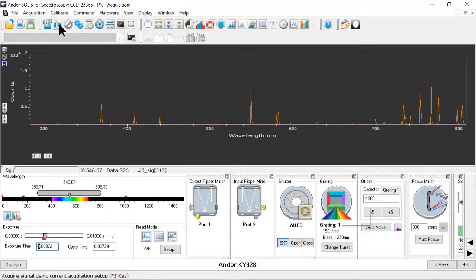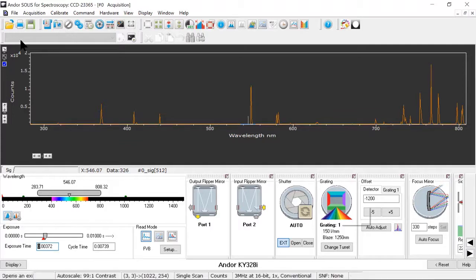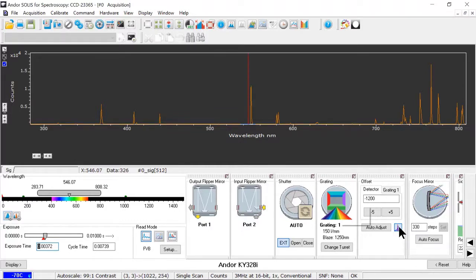So now that I've shown the basics of interacting with the camera and spectrometer, I'll show how easy it is to calibrate. So doing online demos like this, I've been constantly taking apart and reassembling the equipment, so it would be worthwhile to check my calibration. I'm going to pick a calibration lamp line, say the one that I have now, 546.074, I believe, because it's strong and in the middle of the visible spectrum, and set my center wavelength to the nominal value. I already have, so I'm good there. I'll look for my spectral line in the data. I know it's right here, and I know I have this little doublet right here, so I can see where I need to be. And I can also visualize the center of the detector with this button right here. So I can see that I'm off a bit. That's where my calibration comes in. What I'm going to do is adjust an offset, and that's a small number that's applied to the actual grating position when I'm making a grating move to some nominal center wavelength.